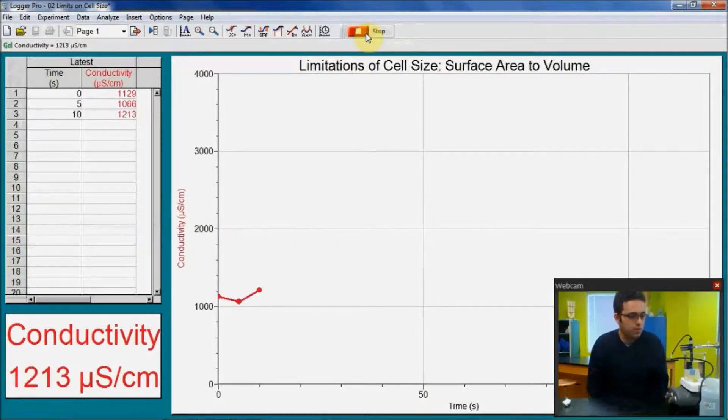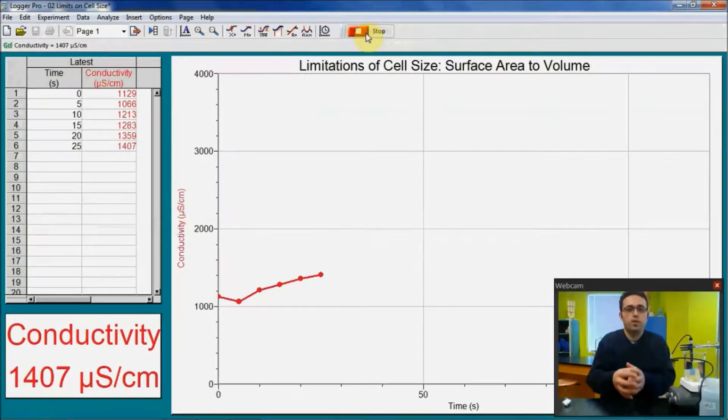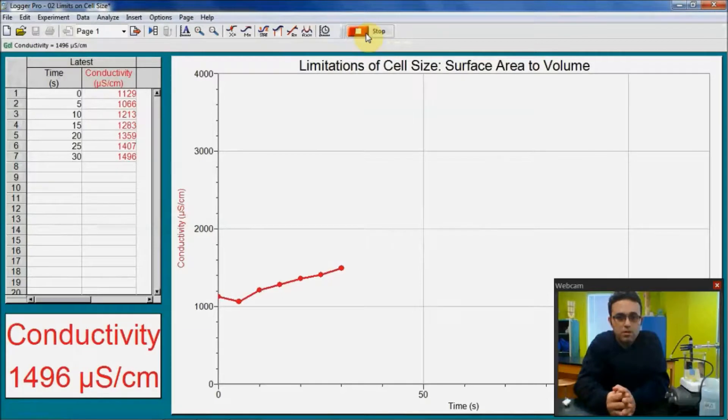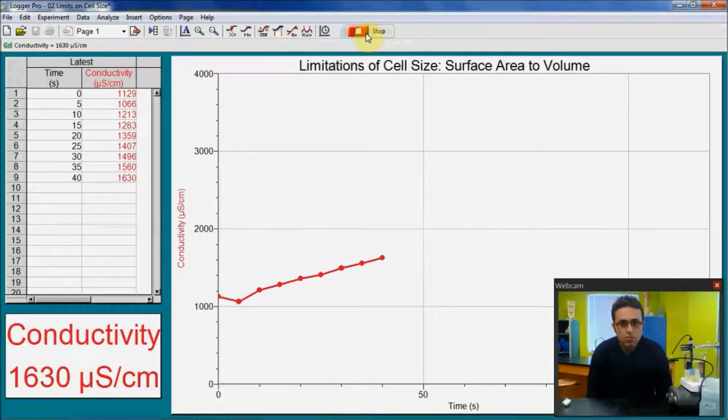The reason we're using this stirrer is to ensure that the salt that is dissolving out to the distilled water is mixed evenly, is distributed evenly throughout the solution. So as you can see, the increase in the ions in the water is pretty linear. There are very small bumps, but it looks very perfectly linear.